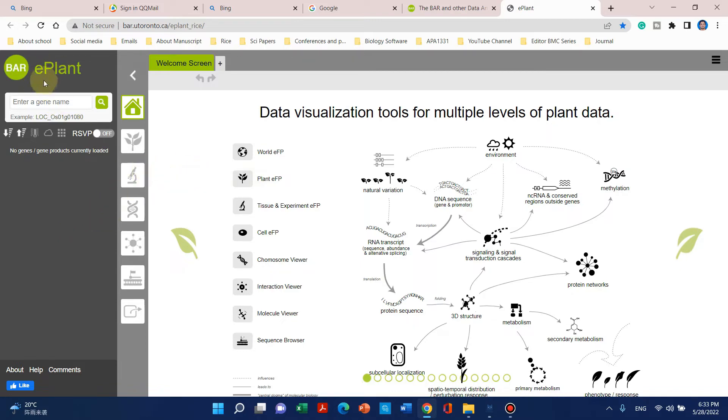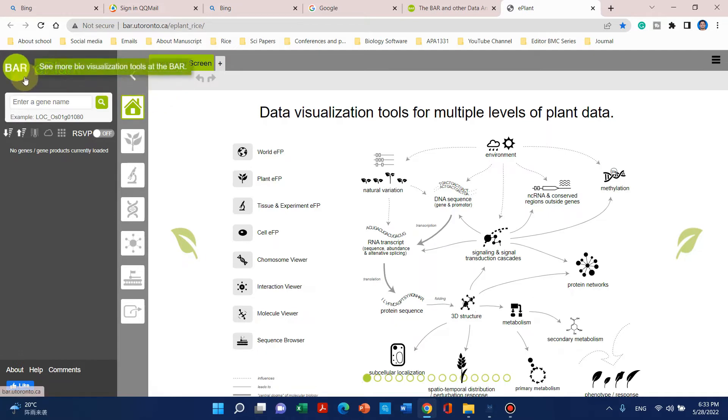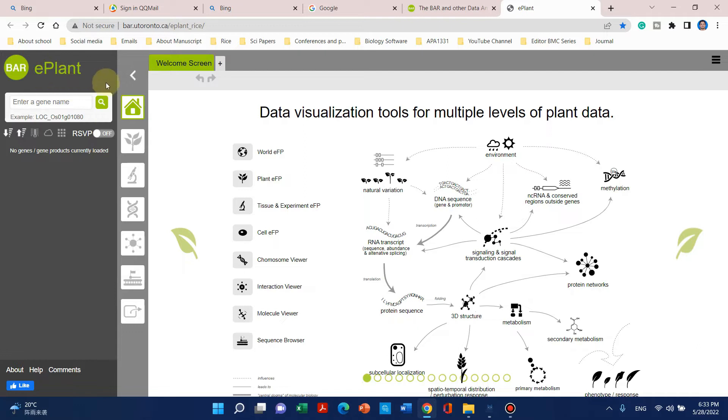Then you can use this BAR ePlant browser. This is actually the rice ePlant browser. Before I go into detail, I can also show you its main website that is also used for other plants.